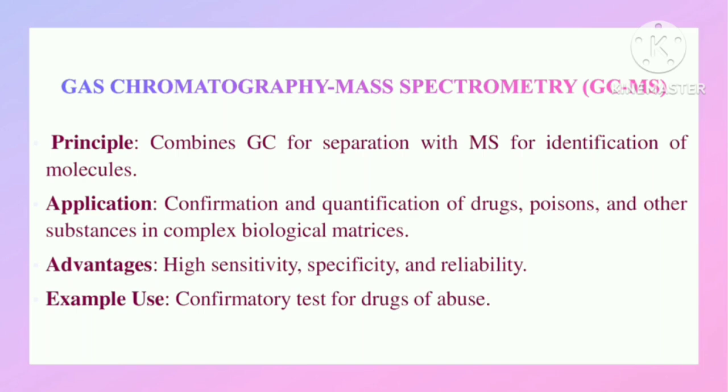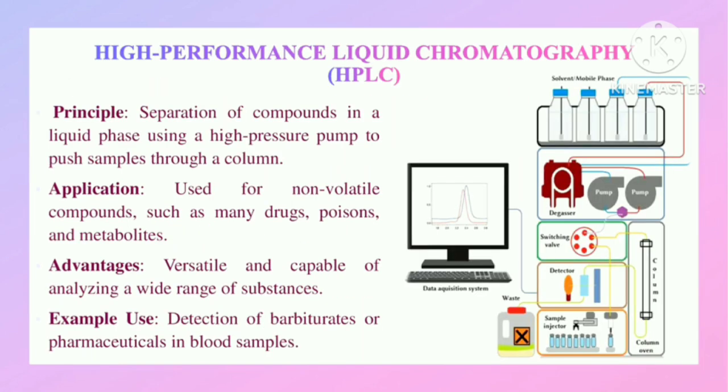High performance liquid chromatography or HPLC. This chromatography works on the principle of separation of compounds in a liquid phase using a high pressure pump to push samples through a column. It is the most suitable technique used for non-volatile compounds such as drugs, poisons, and metabolites.